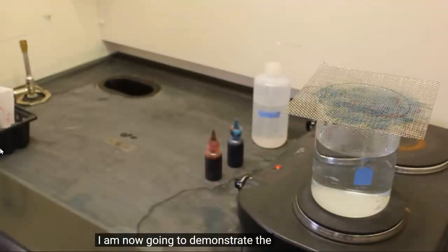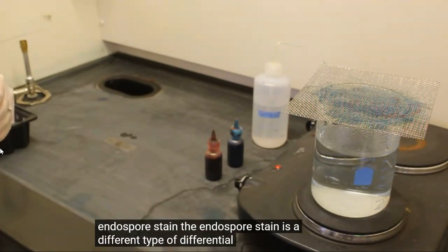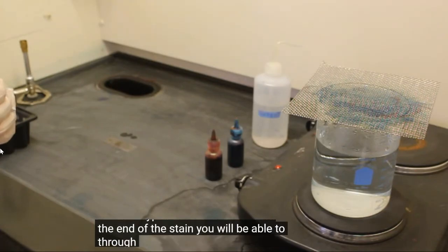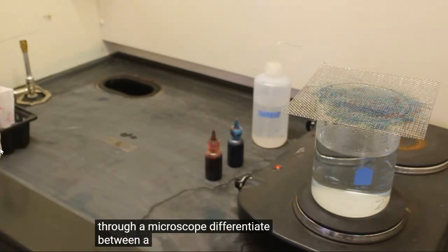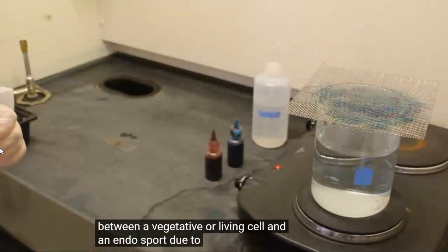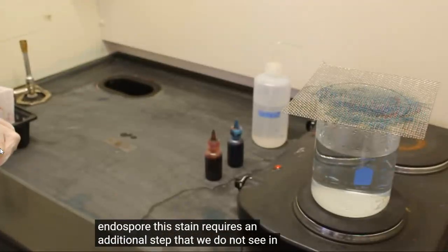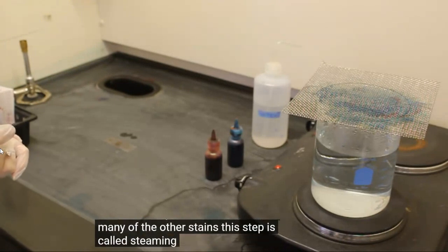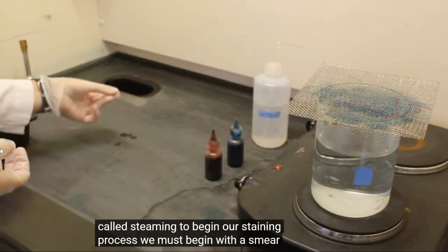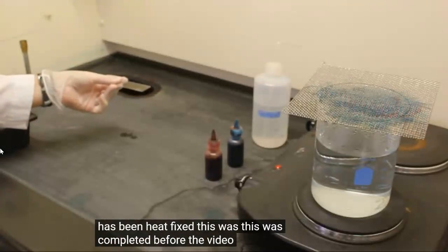I am now going to demonstrate the endospore stain. The endospore stain is a different type of differential stain. At the end of this stain, you will be able to, through a microscope, differentiate between a vegetative or living cell and an endospore. Due to the nature of the endospore, this stain requires an additional step that we do not see in many of the other stains. This step is called steaming. To begin our staining process, we must begin with a smear that has been heat fixed. This was completed before the video began.